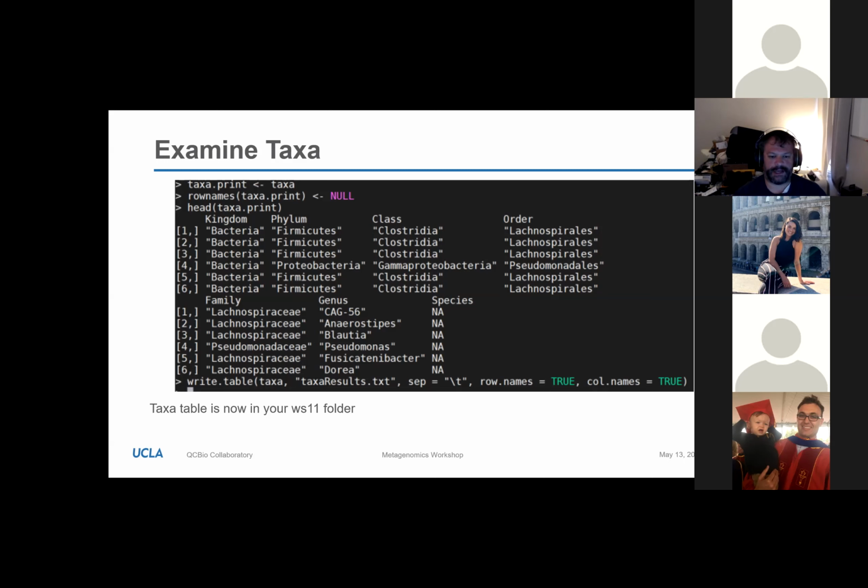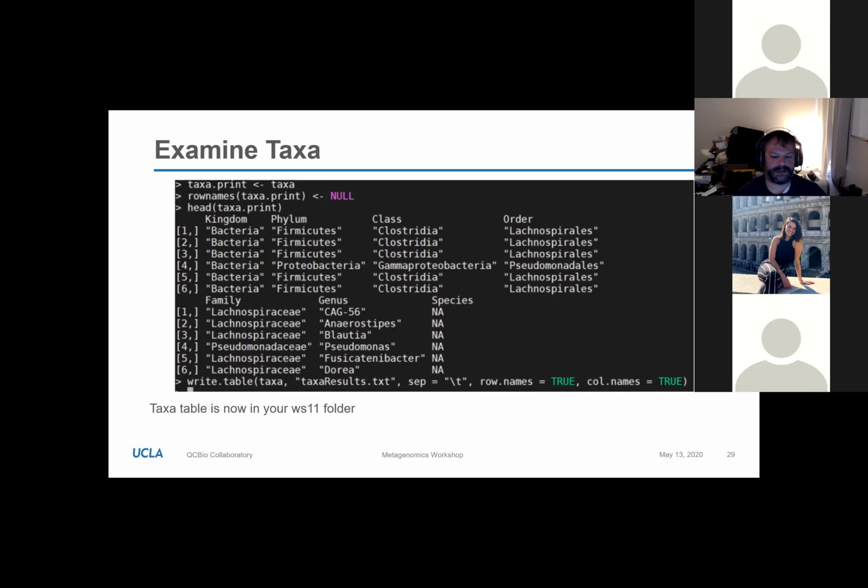So actually, a lot of what you're seeing here, I have packages I made for automating bioinformatics analysis. For example, I wrote a package that will automatically analyze microbiome standards for accuracy. If you look inside that package, it's running a DADA2 pipeline to call taxonomy. But the way it's doing that is it actually has Python running R. Python is generating R scripts on the fly, and then telling R to run the R scripts. R is actually not my main language.